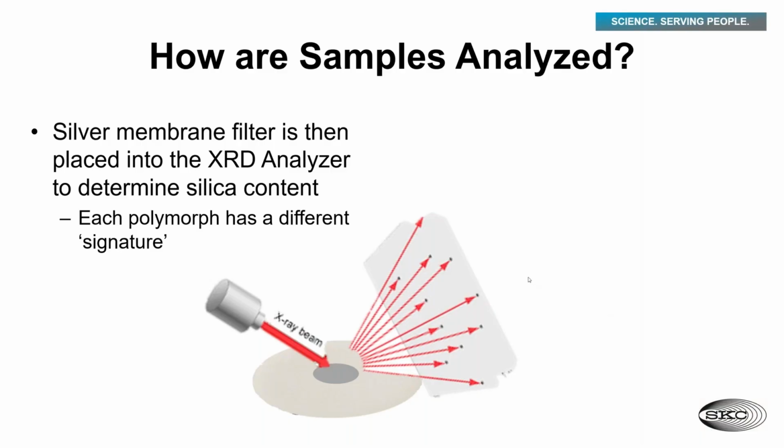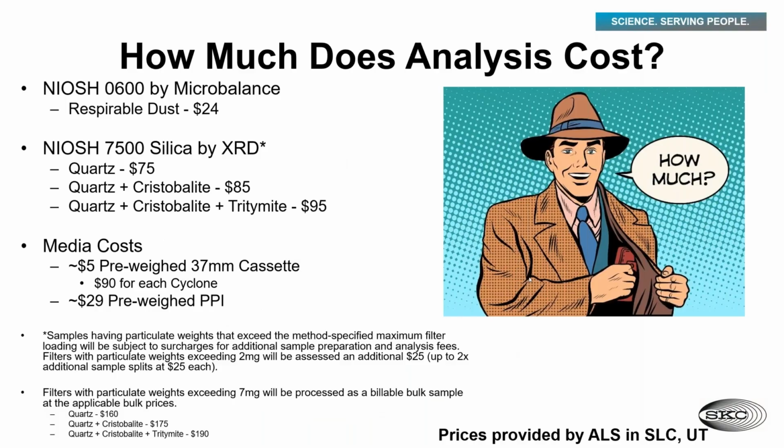So now the next little bit is going to be how much things actually cost. I'm not going to go through every little bit. High level, it is not cheap. It is an investment, not only in the company that you're working for, but also in the health of the person that you're sampling. You're using these samples to see how much dust is in the air, to know what controls to put in place, to know what you have to do next to make sure that they are protected.